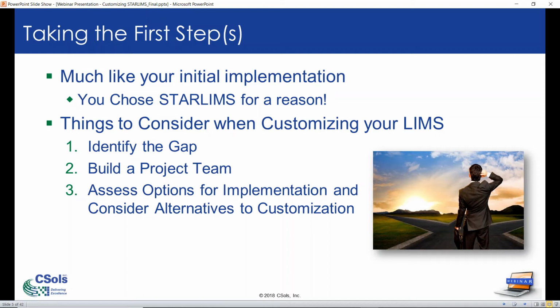I'll touch on all of these, and with customization, I'll encourage you not to rule it out based on perceiving that it's difficult, especially with respect to upgrades. With one of the most heavily customized systems I've ever worked on, we kept the system at its most up-to-date version and even pushed for pre-release versions when they had features that we needed. So a well-managed system can be customized and maintained. And besides, you probably chose STARLIMS because it's flexible and feature-rich. With that, let's discuss what to consider.